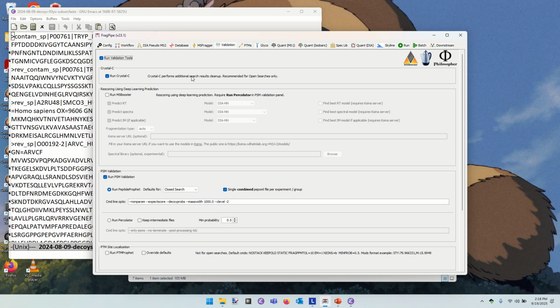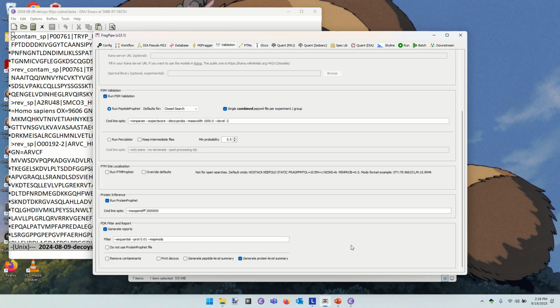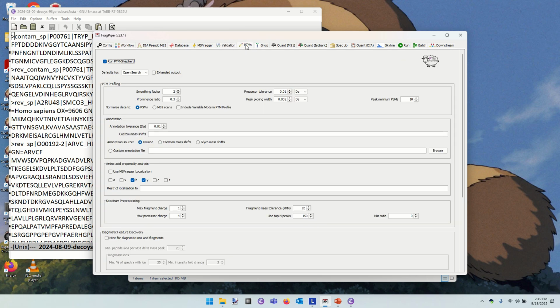What else do I want to note here? Yeah, there are a fair number of pieces in here. Obviously, the options continue running all the way down here. Is this where it does the generate subset database thing as well? I was trying to find that. Well, I'm not finding it at the moment. It's okay. All right, so the validation thing, we're leaving everything as is.